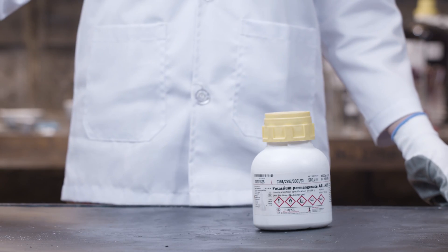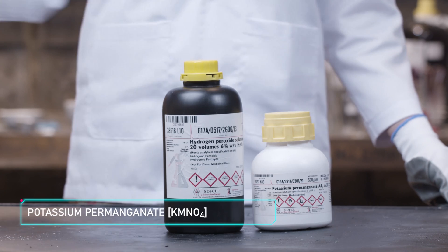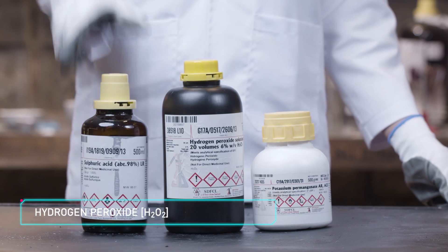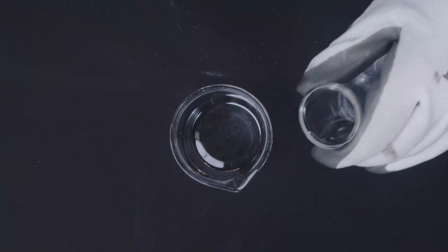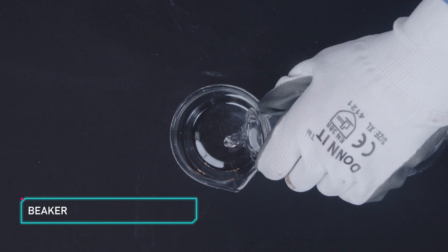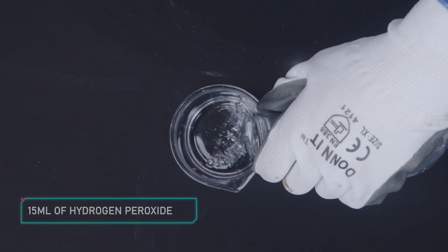So our pals for the day are potassium permanganate and hydrogen peroxide. Let's go! First, get a beaker and pour in 15 ml of concentrated hydrogen peroxide.